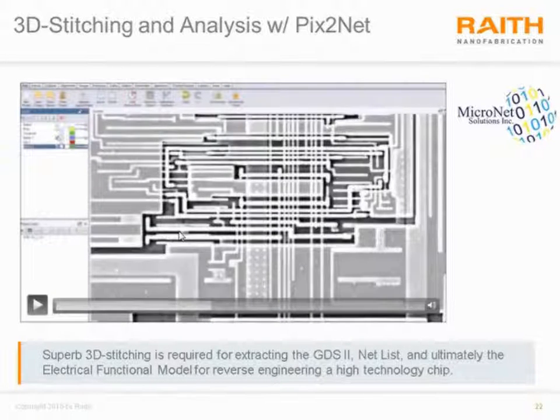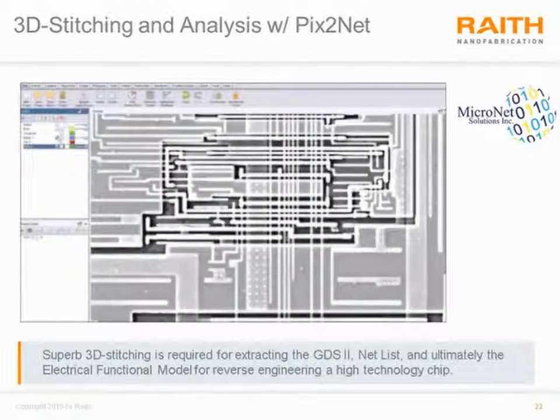And finally, we have metal layer 2 and metal layer 1 being overlaid at a higher resolution, one on top of the other. The diameter of these vias is 150 nanometers. Now watch what happens when we remove metal layer 2, which contains these vias.